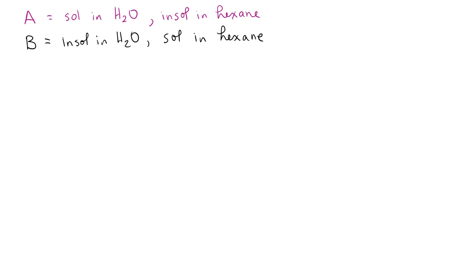And our goal at the end of this, well, I do say your end result is to have solid A separated from solid B. Okay, so let's mix these two things together. You have A and B together in a flask, and they're two solids and you can't tell the difference between them. It's not like you can go through and filter them. They're not different shapes. So what are we going to do using this solubility to separate A from B? There are 2 possible routes.